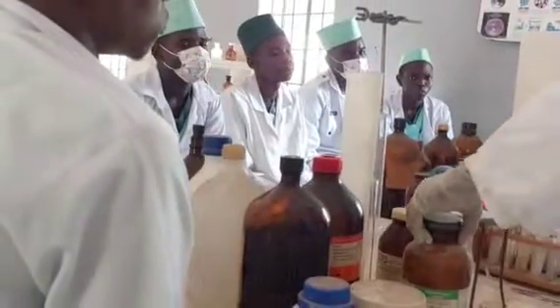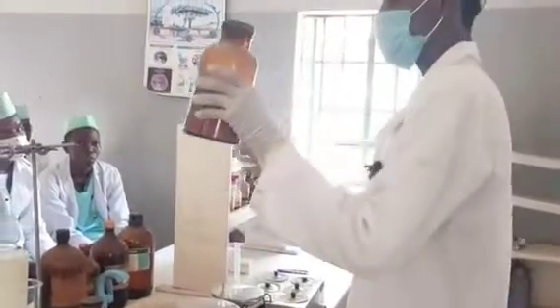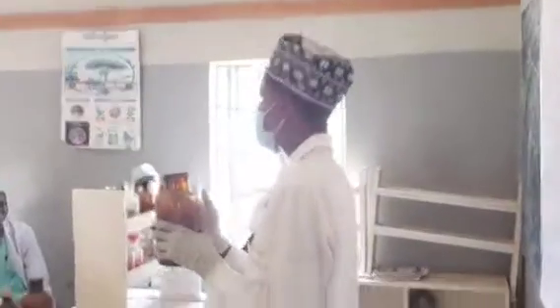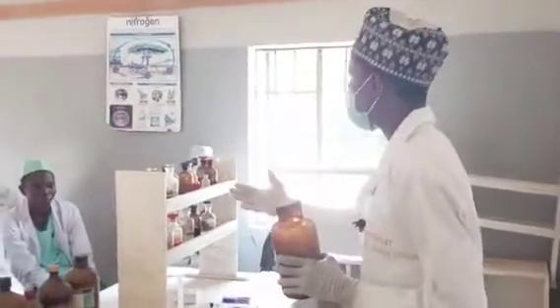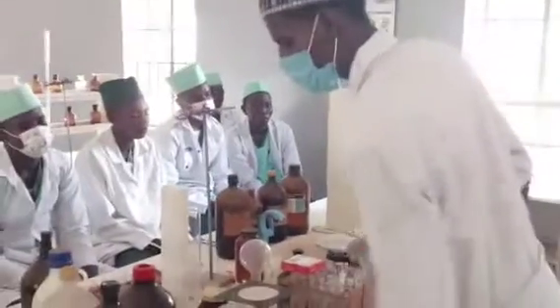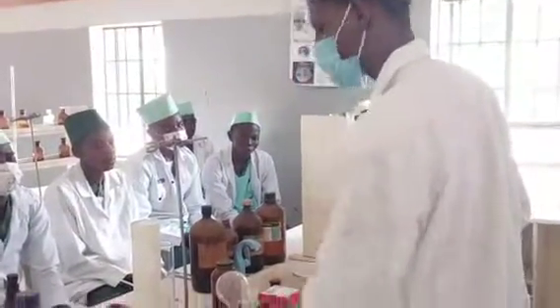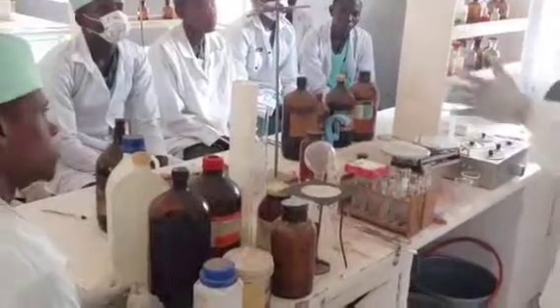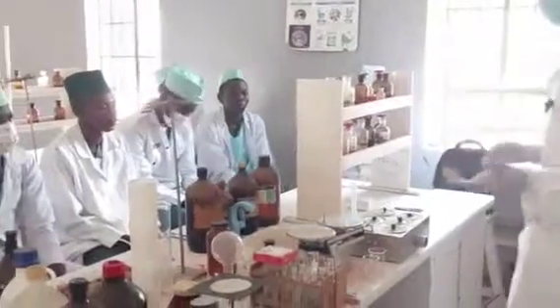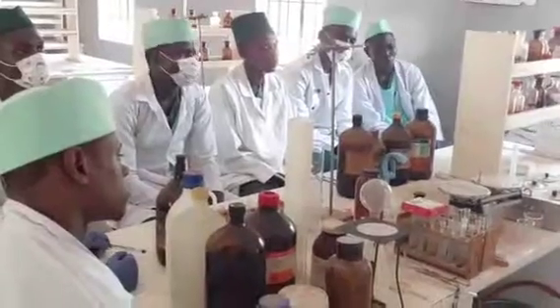We also have some solid reagents here with us. This is sodium carbonate. Even some of the solid reagents are stored in amber bottles. Why? Because they are photolytic in nature. But look at this, some are just stored in normal bottles, but in most cases they are not transparent, because different salts and solid samples have different behaviors to temperature and the rest.